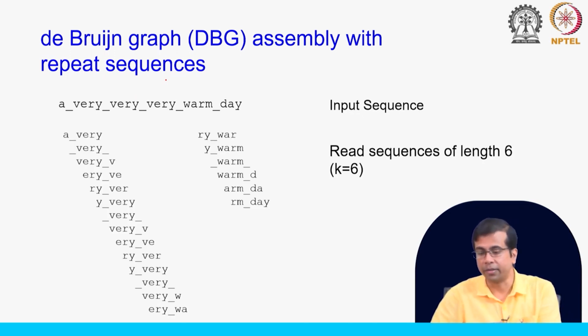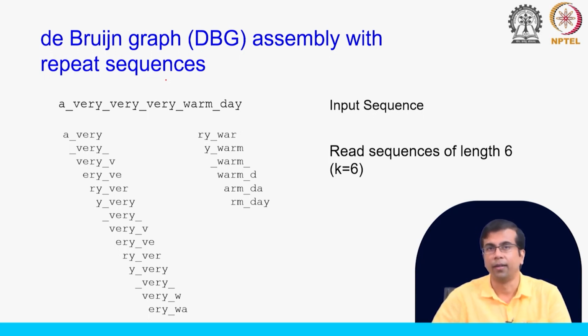We work with reads of length 6 just as an example. You can try with other lengths as well, that is not an issue. The process is exactly the same. So, here are the reads that you can find from this sequence, and you will probably notice some of the reads are repeated, because they are coming from the repeat regions. One of the assumptions that we are making is that every region is represented equally. In other words, we are expecting uniform coverage. Every region of the genome is covered uniformly, and we will see later on what happens if we deviate from that assumption.